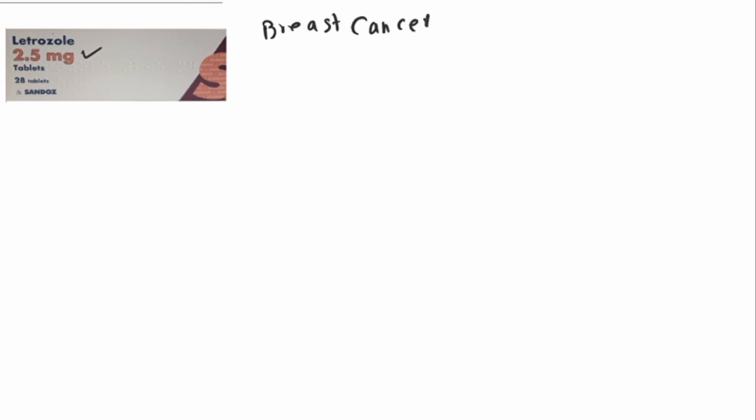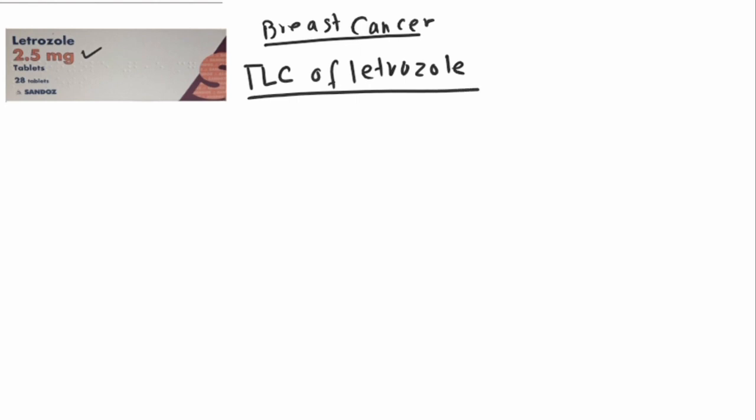We are particularly focusing on one aspect of the quality control testing, and in this lecture we are going to discuss TLC of letrozole, how TLC of letrozole is conducted. So mainly we are going to discuss that. All the information you can see in the British Pharmacopoeia. All the information is derived from that.